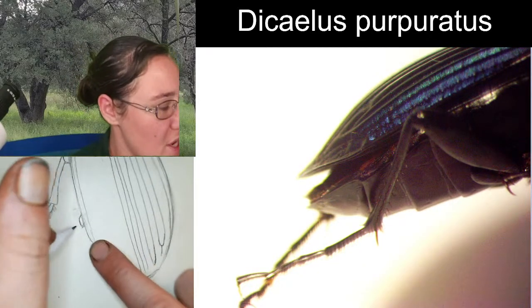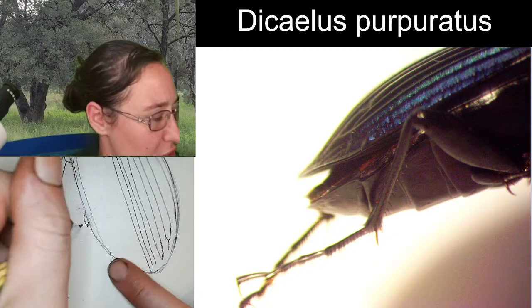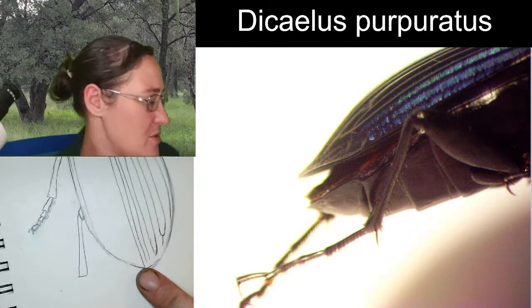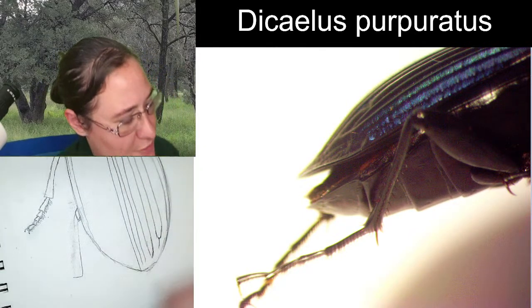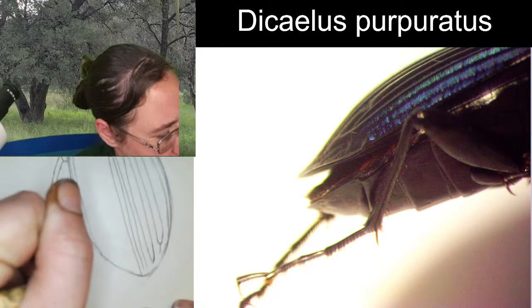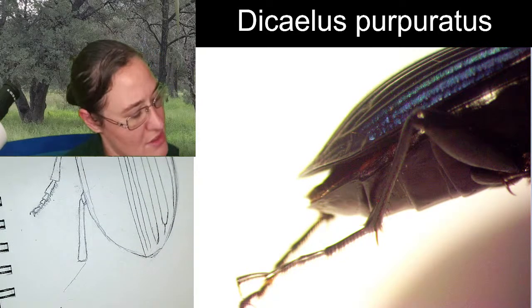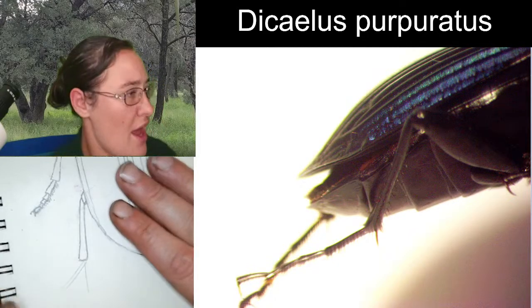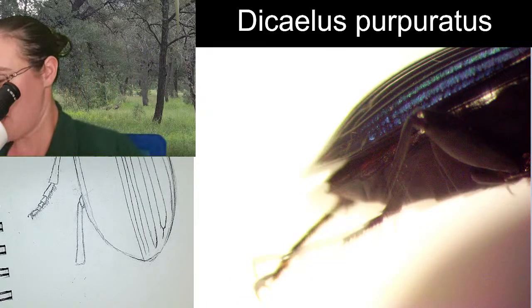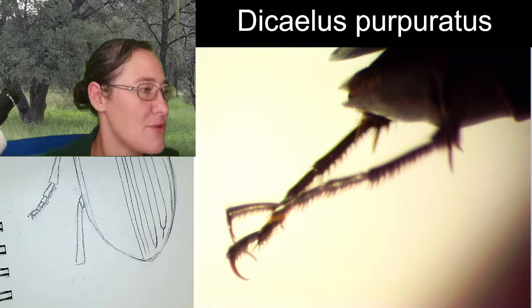So we're going to start here. I'm going to just stretch this leg out. You can see that the tibia goes about to the length of the body. Yeah, it's right around here. The length of the body. And then you have tarsal segments. I'm going to make my tarsal segments angle out just a little bit, not too strongly. And they are fairly long, and they have these same really distinct bristles that the middle legs did.